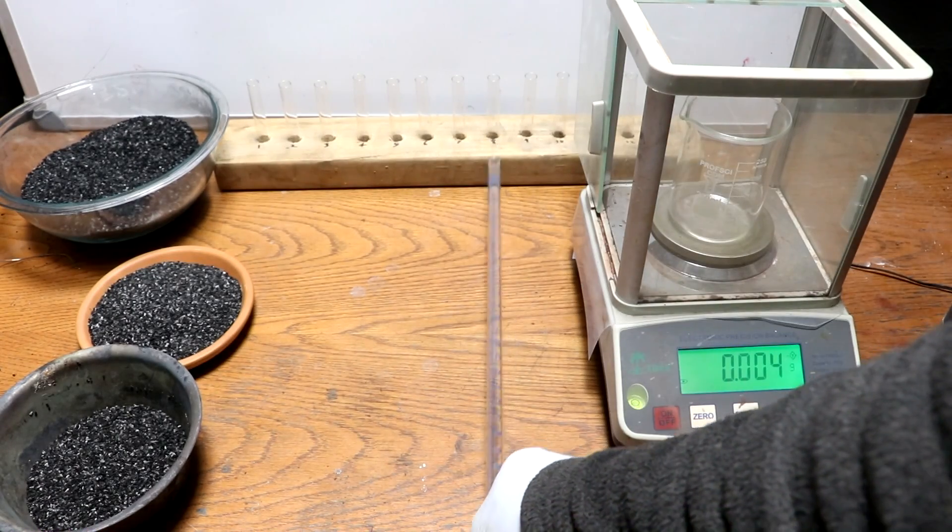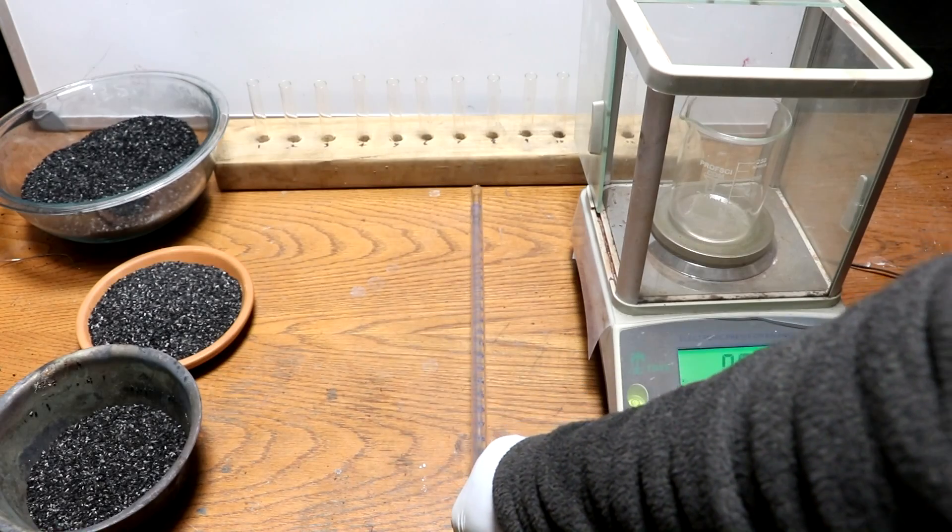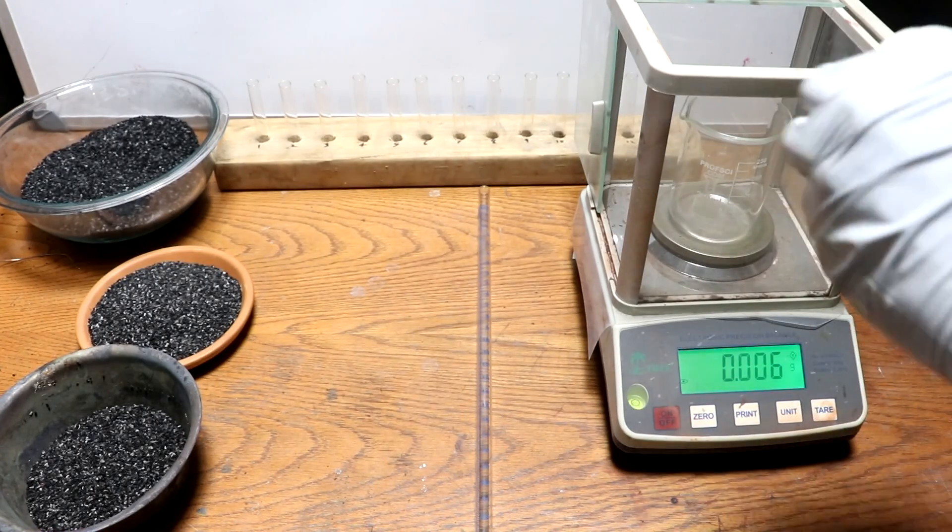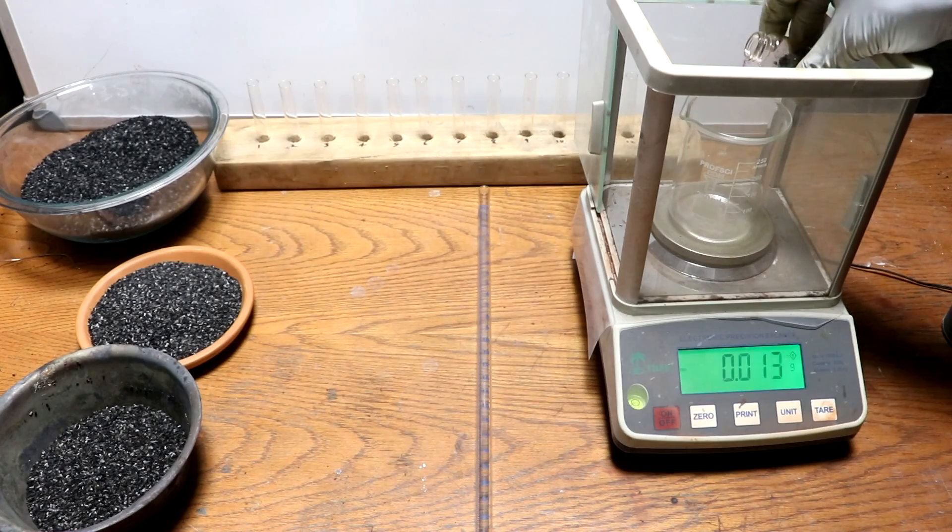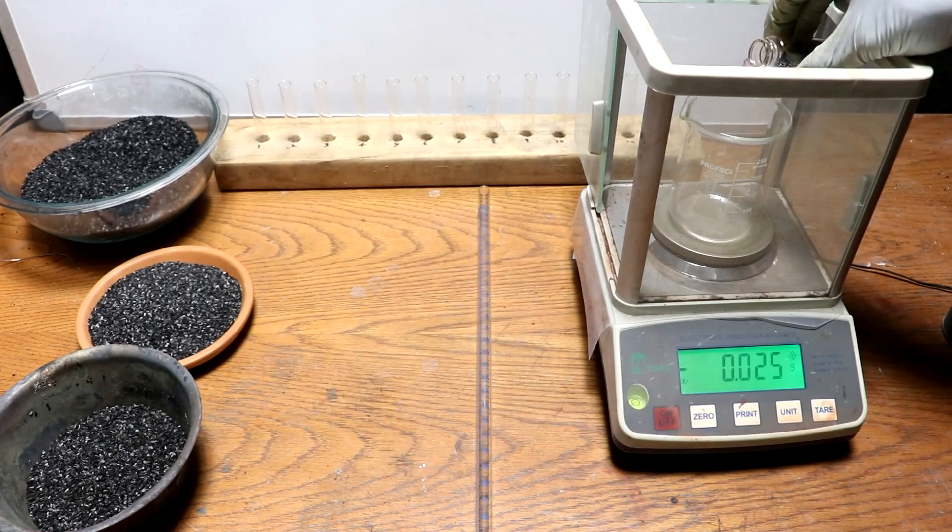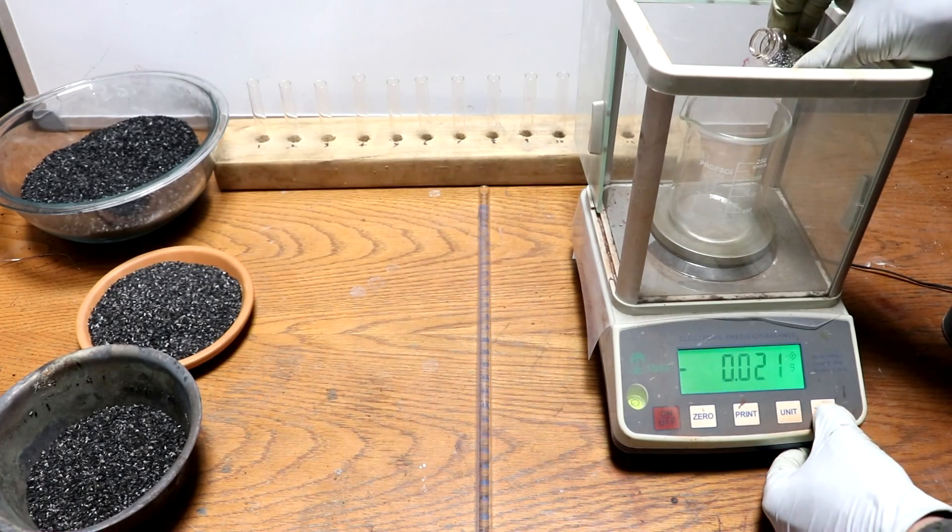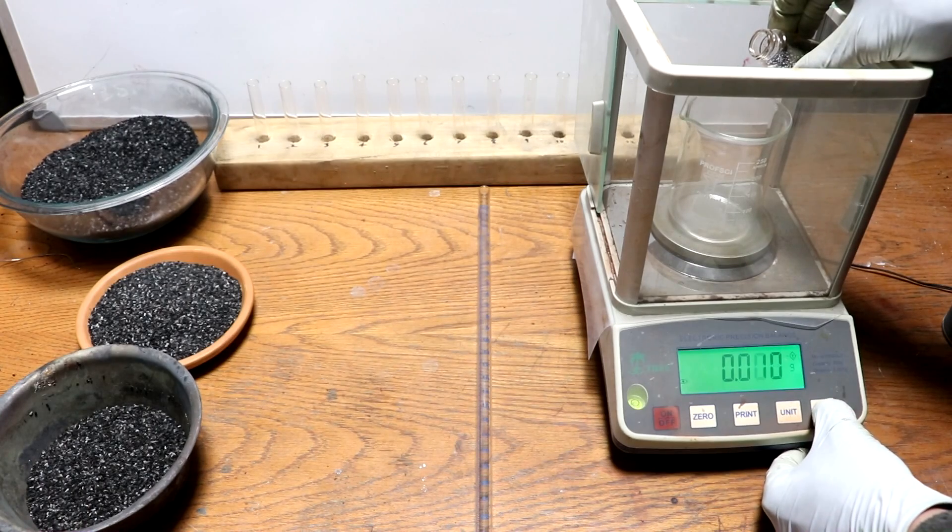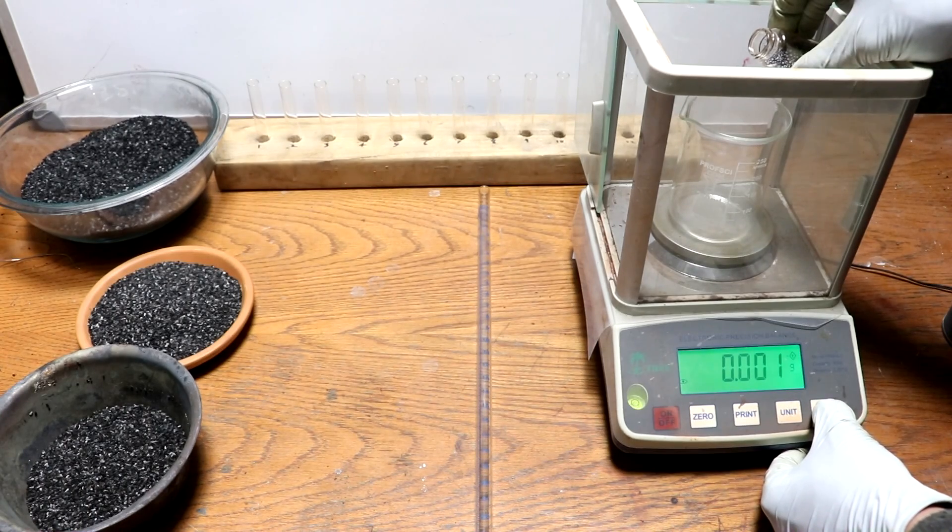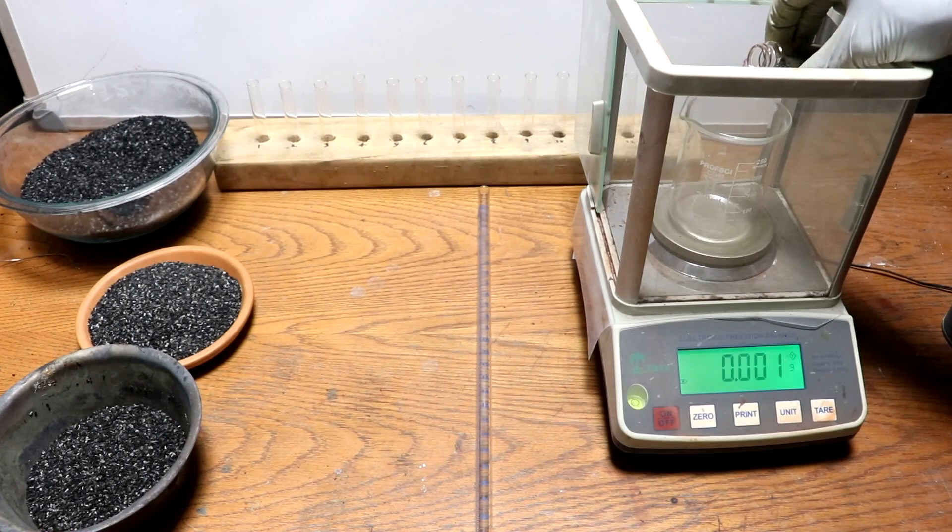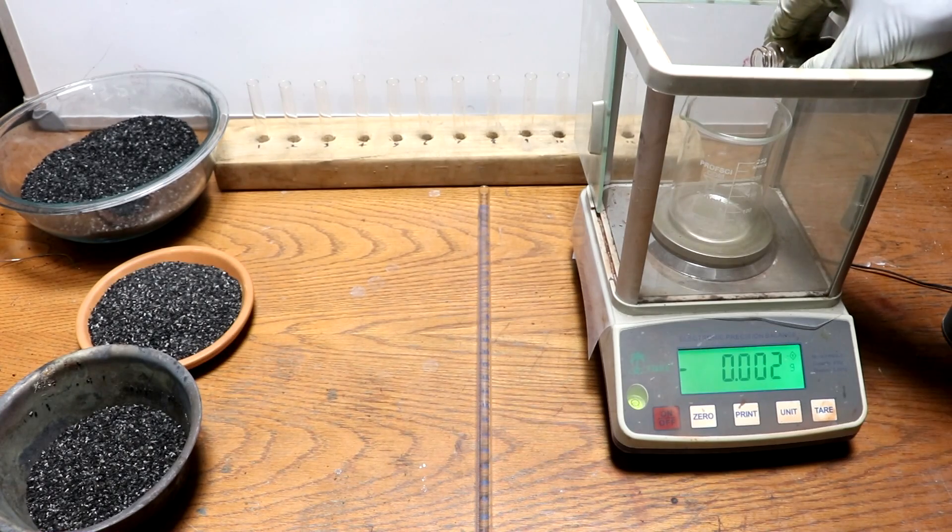So I have a burette here and a bunch of test tubes. Let me weigh out some iodine and make a standard solution. I'm going to try for about a gram of iodine and I will dilute that with 250 milliliters of alcohol.